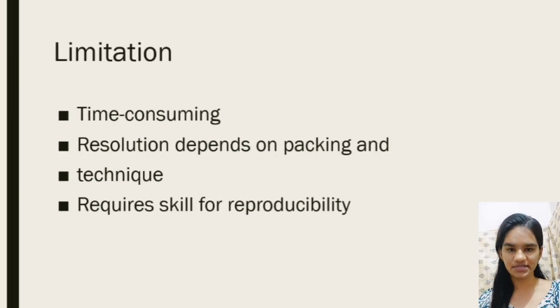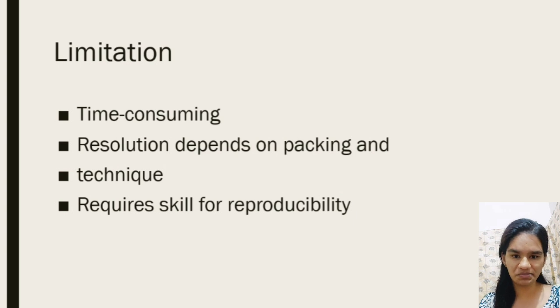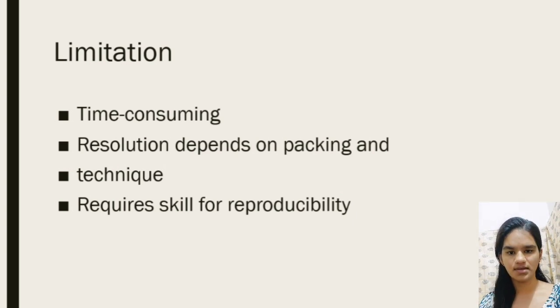Now let's see the limitations of column chromatography. It is time consuming, resolution depends upon the packing and technique, and it requires skill for reproducibility.